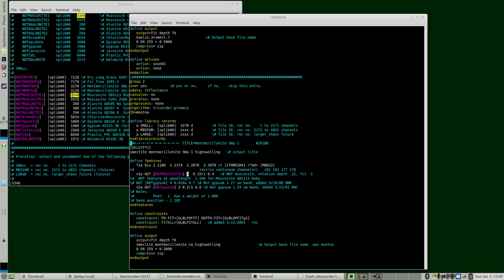So there are basically hundreds of materials that are defined in group 2 and potentially hundreds in each group. So what happens when Tetracorder goes through all these feature definitions, knots, constraints, all of those impact whether or not that feature is plausibly there.